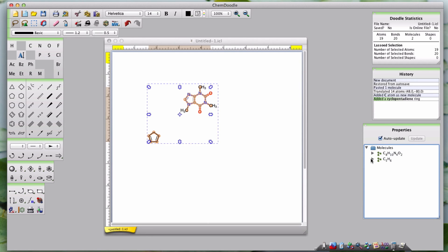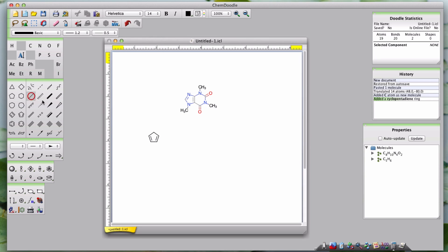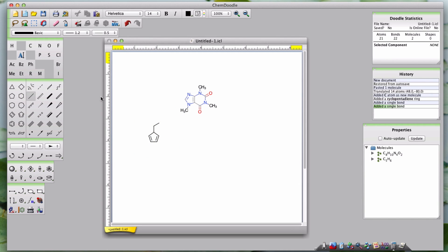Above the main panel, there is a checkbox which allows you to turn on or off automatic updating of the widget. This can be useful when making numerous changes on larger molecules.